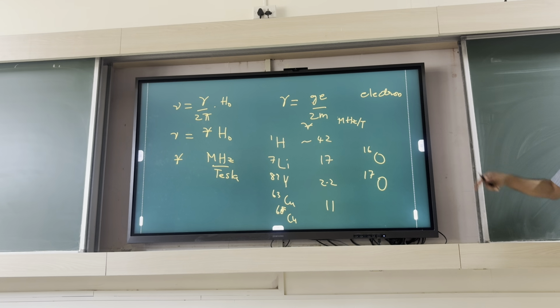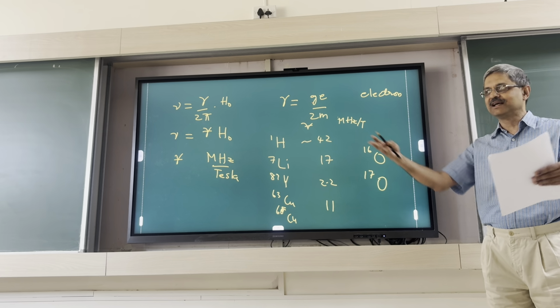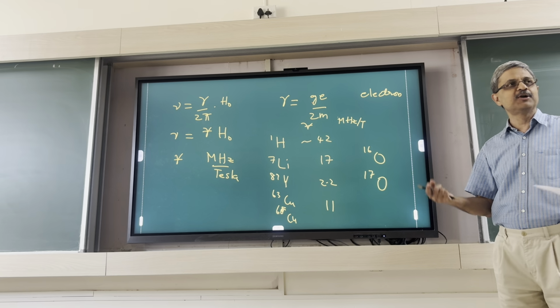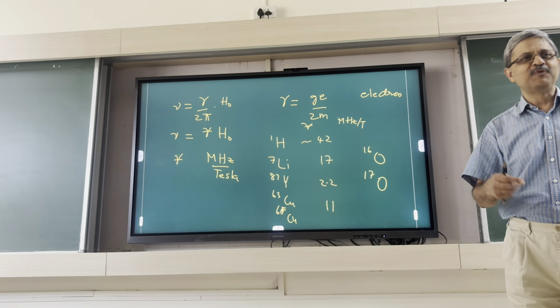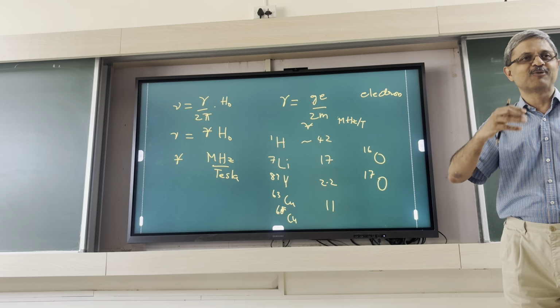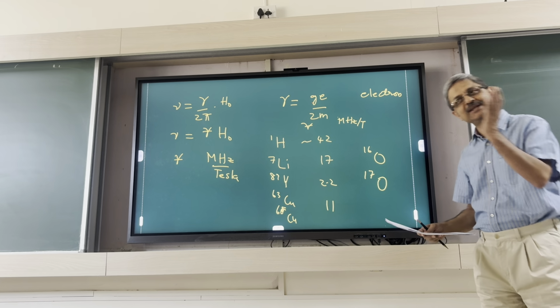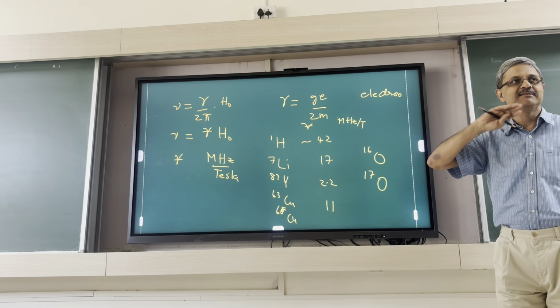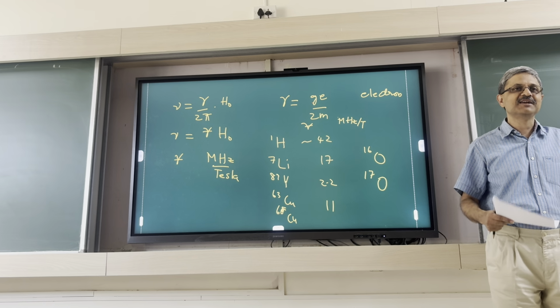So how can you now still, sometimes you really want to measure the oxygen because it's located at such a position that you are trying to probe the magnetism from some copper or something else, and this is really a good probe. So what do you do? High magnetic field. But if its abundance is so low, you cannot go to 100 Tesla. From 1 Tesla you can take it to 10 Tesla. So this is one way that you try to increase the field to improve the sensitivity. But not always possible. You have the same magnet. You are measuring other things.